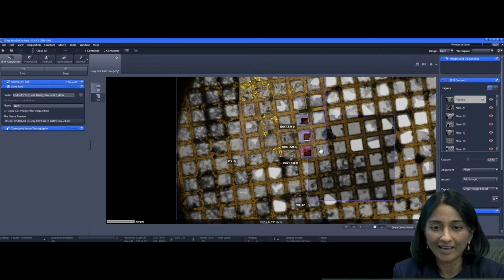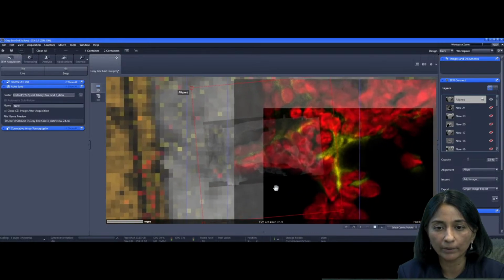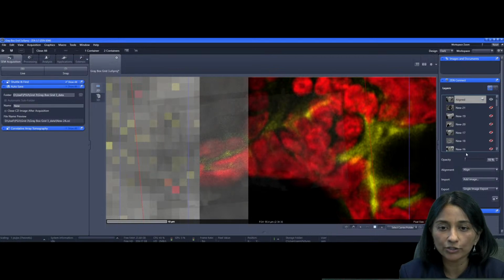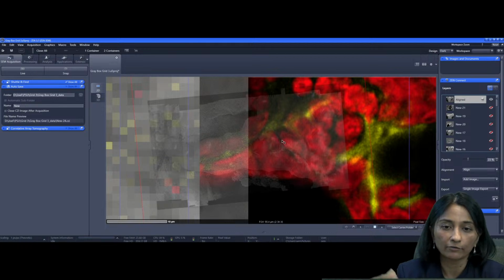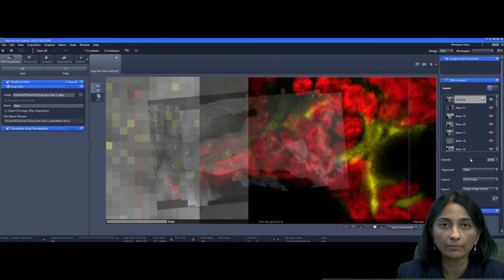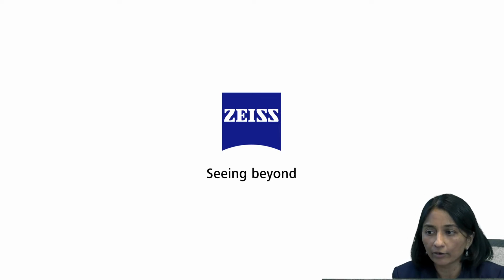This last video that I have from this presentation shows you how you can zoom into the light microscopy data, overlay a slice from your 3D volume image, and then you can correlate the exact same region from the light microscope using data from the electron microscope. So this is essentially what we do in the cryo correlative workflow, where you take images from the light microscope, image the exact same grid, same ROI on the electron microscope, and you can overlay that information from the EM onto the LM data. So with that, I have come to the end of my presentation.